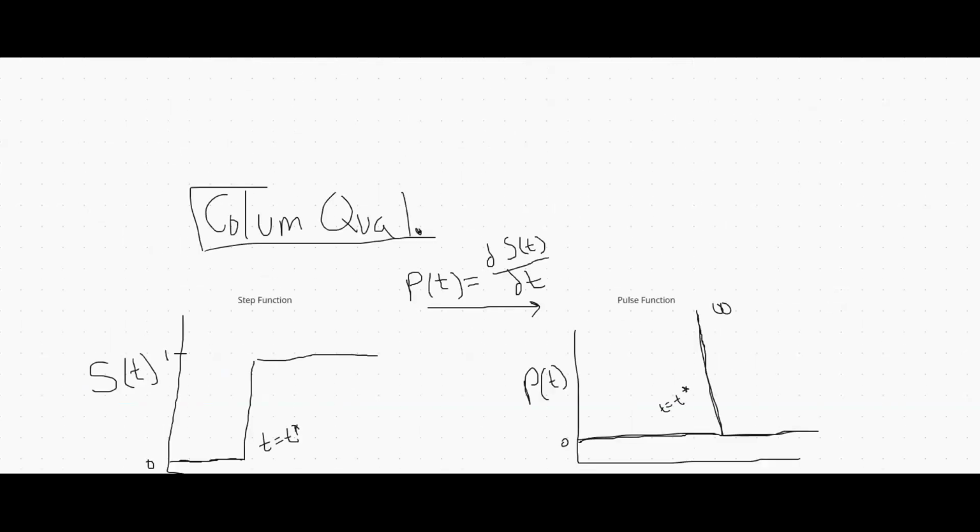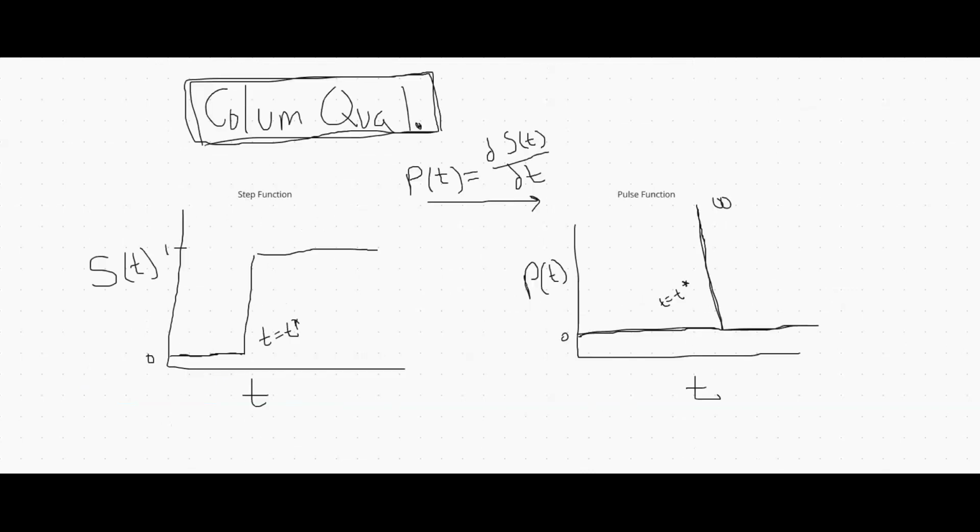Today we're going to be talking about column qualification, specifically phase transition analysis. I hope to touch on the background of what's going on with this kind of column qualification analysis, give you a few reasons why you might use it, and then show you one way that you can do the analysis. So let's get started.